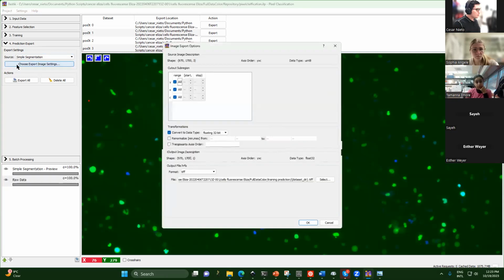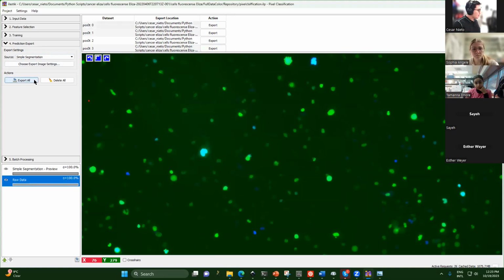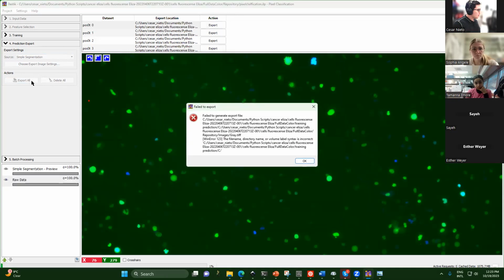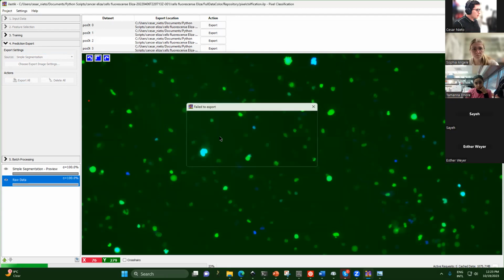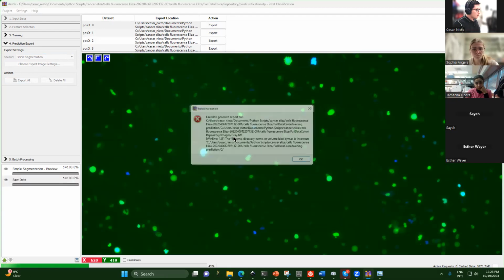I have no idea what happened. Okay, here maybe it's something with the names.